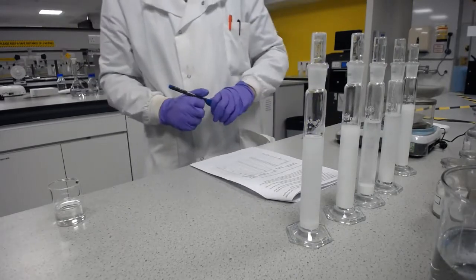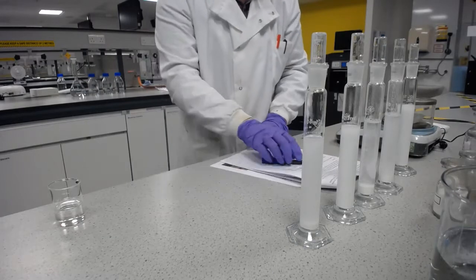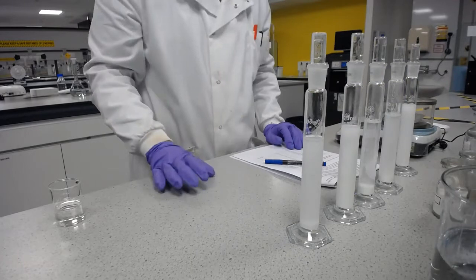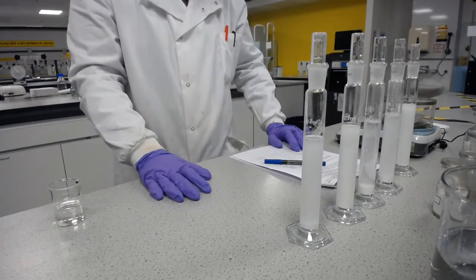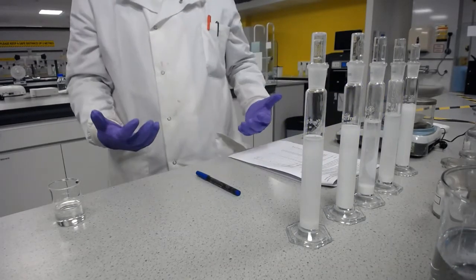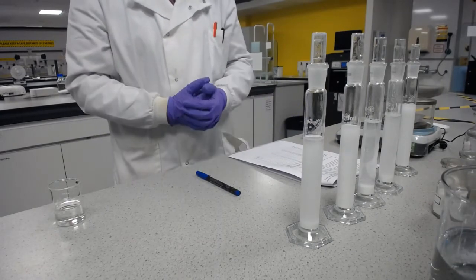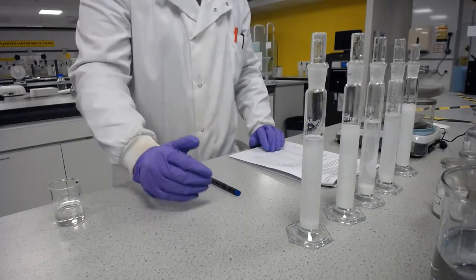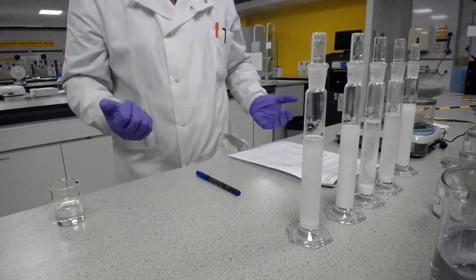And we've got to 30 inversions again, and it's still not budging. So we can see that just the water and the very high strength electrolyte, it caked. So we've got caking, and then with all 3 of these other strengths, flocculation, because we've been able to adequately, and with relatively few inversions, redisperse. And then we've got to the higher strength where we've deflocculated. We've gone through flocculation to the point where we've got an electrolyte so strong that it is now deflocculated again, and it's still caking.